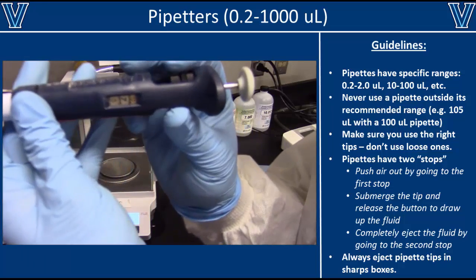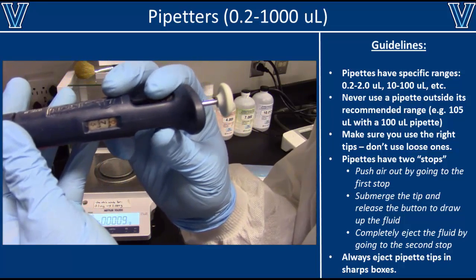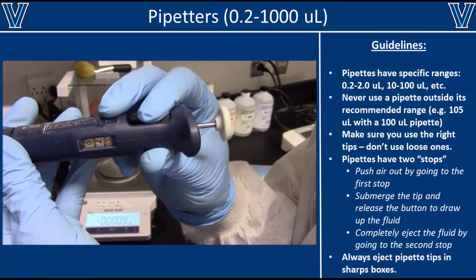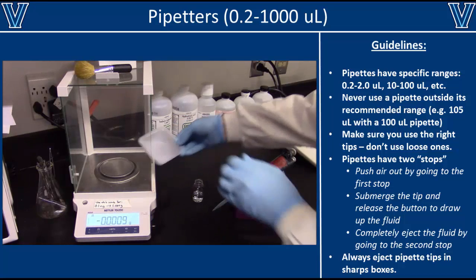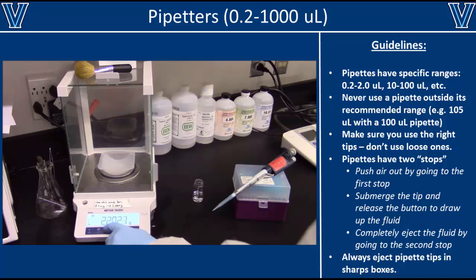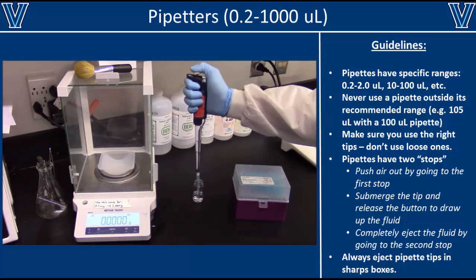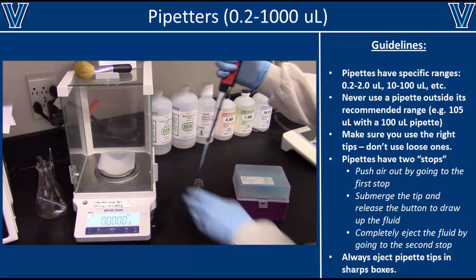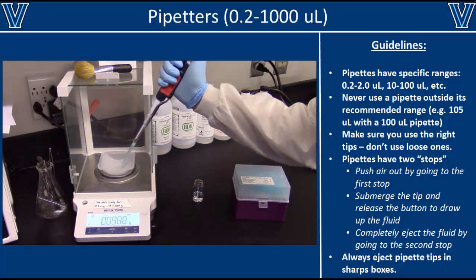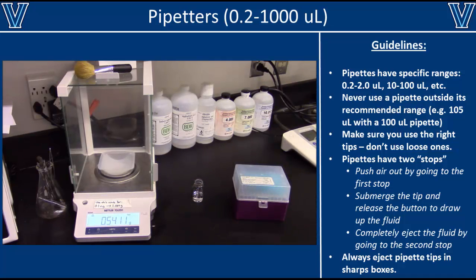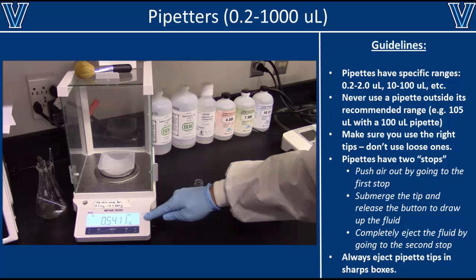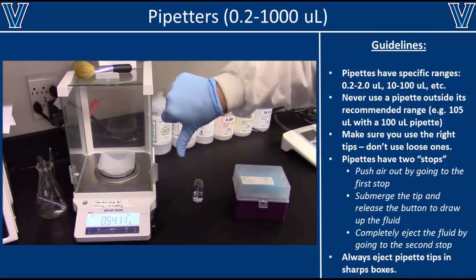If you ever think a pipette isn't accurate, you can test it using an analytical balance. In this example, we are going to test a P1000 pipette by setting it to 700 microliters. Since the density of water is 1 gram per ml, 700 microliters of water should weigh 700 milligrams. Begin by taring a weigh boat, and then slowly transferring the liquid volume to the weigh boat. Make sure you completely eject all of the liquid, then close the doors on the analytical balance and wait for the reading to stabilize. In this case, the reading is only 541 milligrams, which is much less than the expected 700 milligrams.